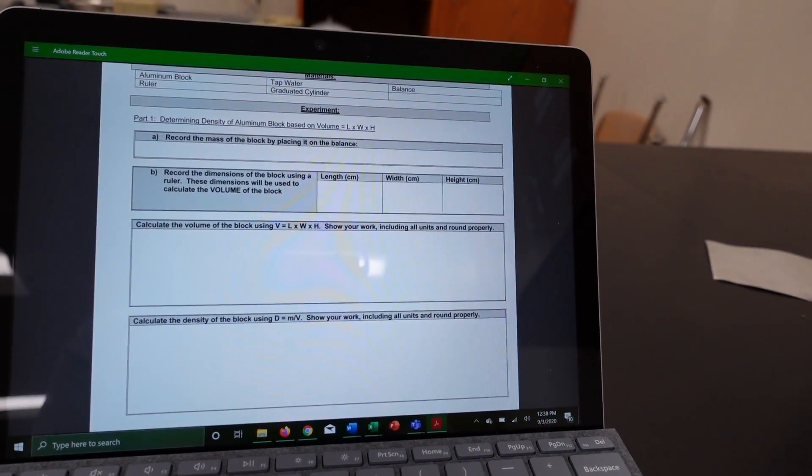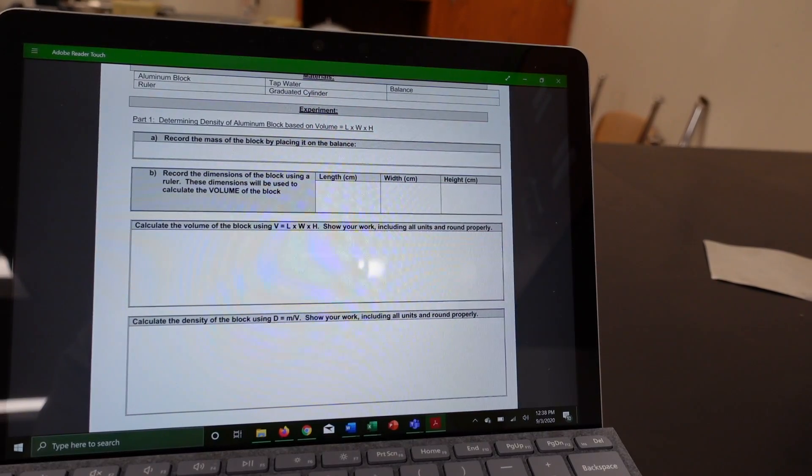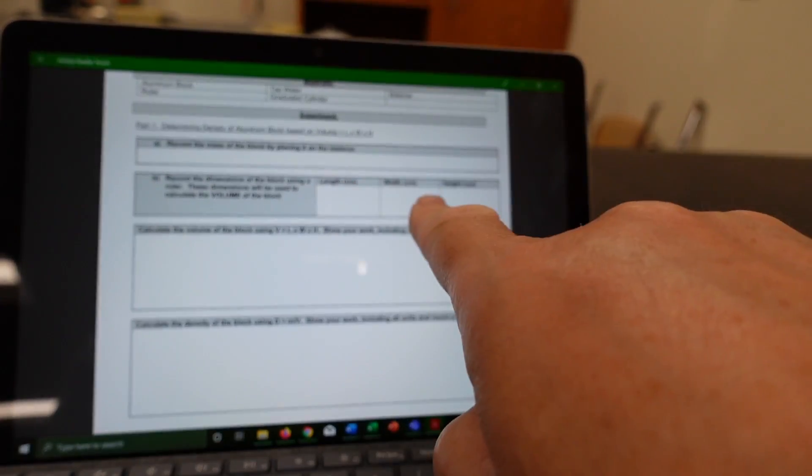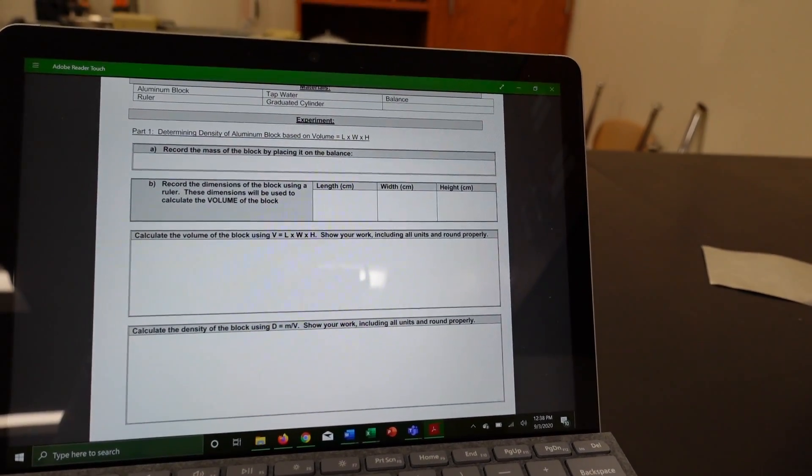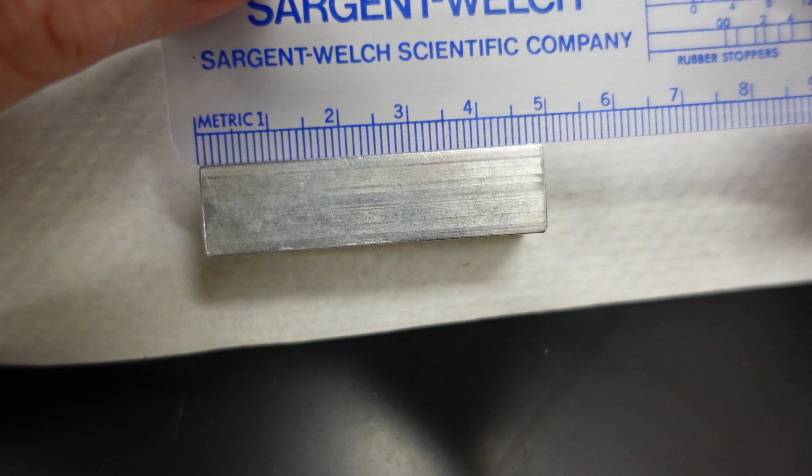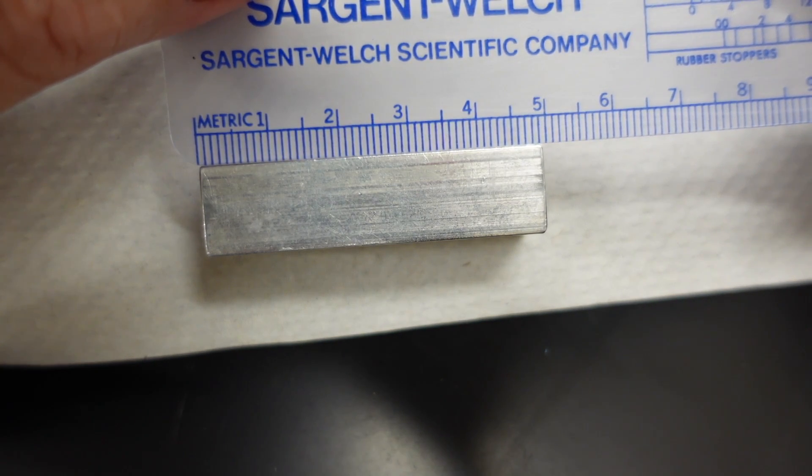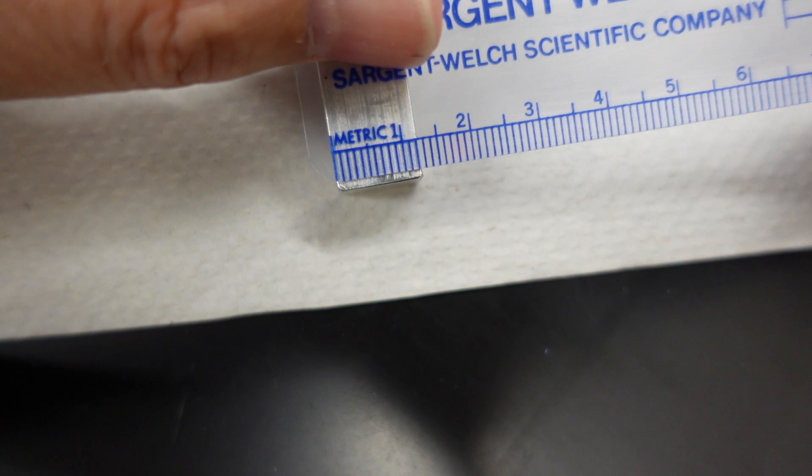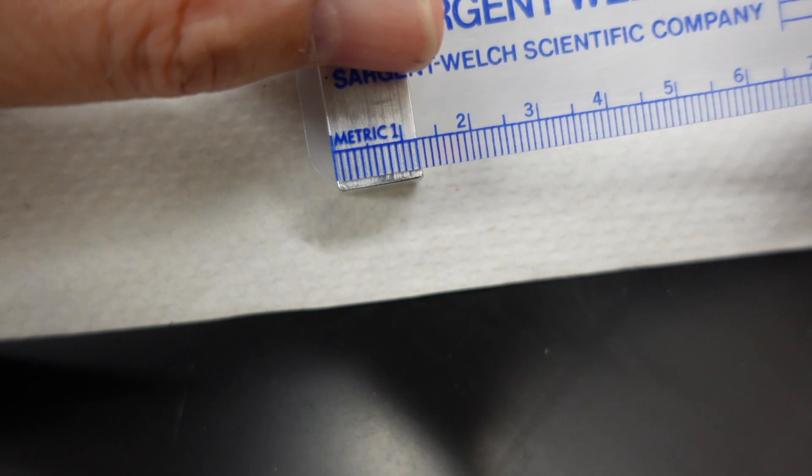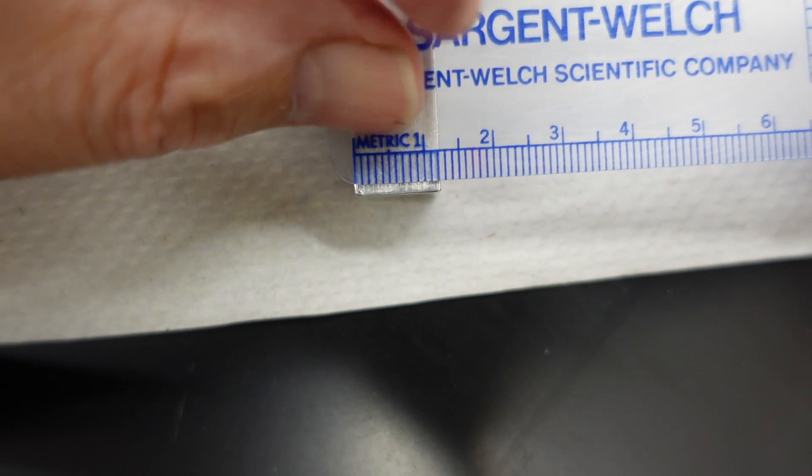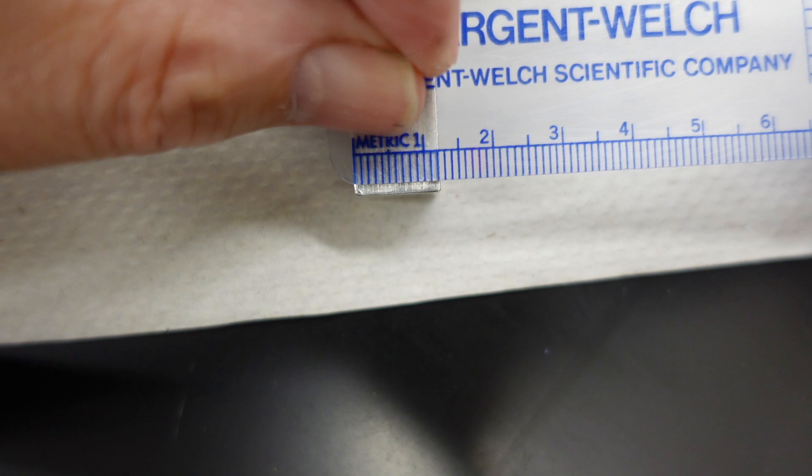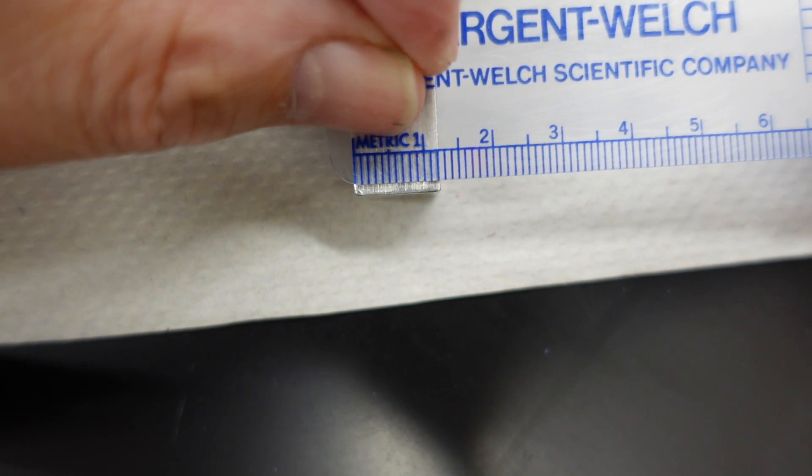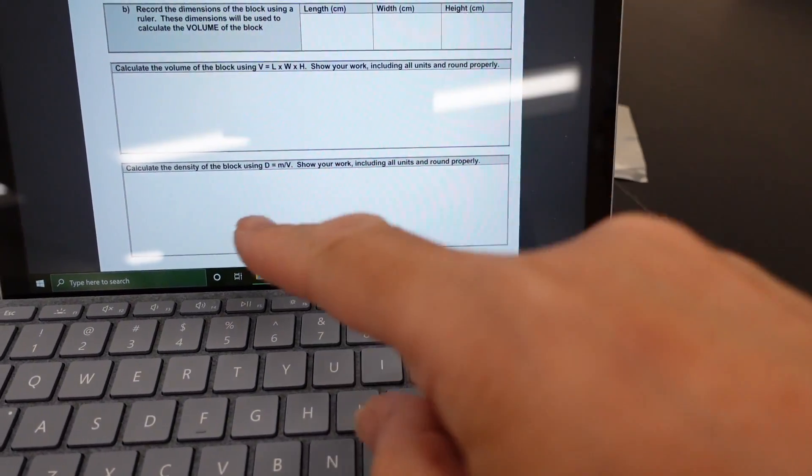The next item we have to look at is recording the length, width, and height of the aluminum block. So, let's do that now. Length. Width. Width. And height. This is measured in centimeters. Okay.